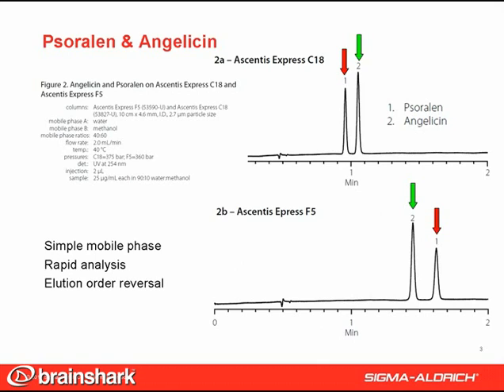This figure shows the major compounds, psoralen and angelicin. Note the simple water-methanol mobile phase, the rapid analysis under two minutes, and the fact that the F5 and C18 gave elution order reversal.